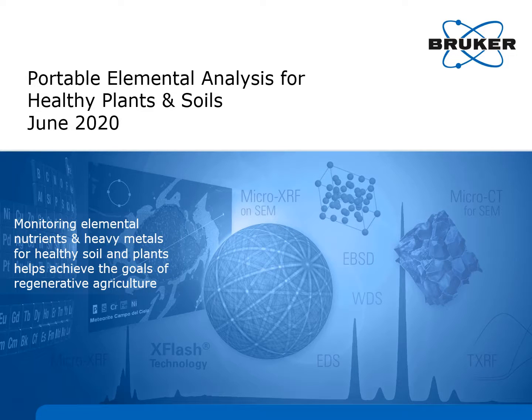Scientists try to help large and smallholder farms go beyond practices for sustainable agriculture to regenerative ones. This presentation describes portable elemental analysis and its applications to help meet those goals.